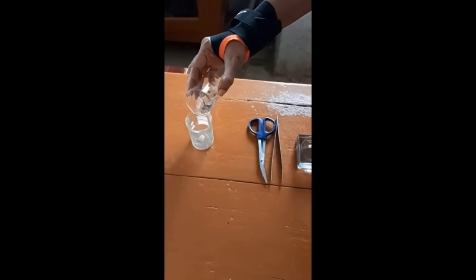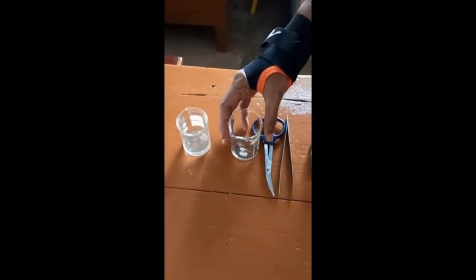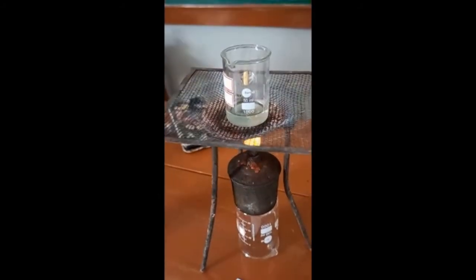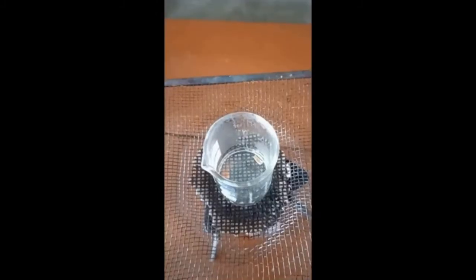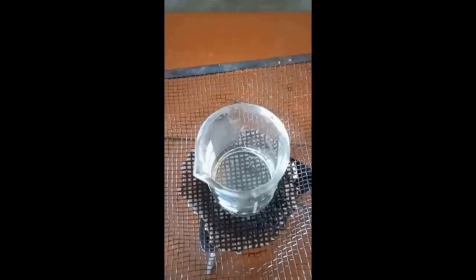For mounting we have to place the piece of skin in a beaker and pour 5 to 10 ml of 10% KOH to it. Then we have to boil it. KOH will dissolve all the soft parts of the skin and only scales will remain. After boiling for about 10 minutes, the piece of skin will appear almost transparent. At this stage all placoid scales get separated from the skin.